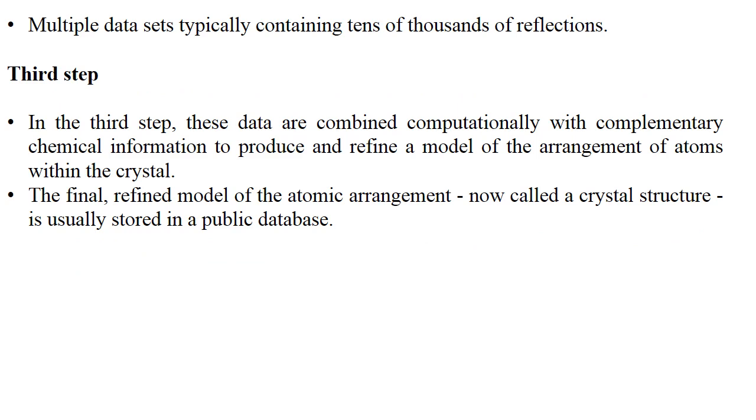Multiple data sets may have to be collected, with each set covering slightly more than a full rotation of the crystal and typically containing tens of thousands of reflections.